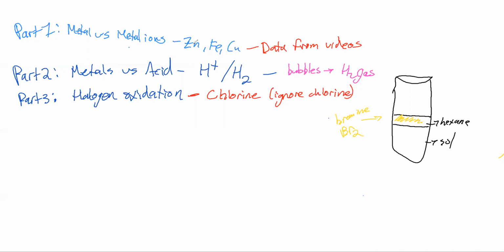On the other hand, our iodine, it takes on a different color. This one is more of a violet.